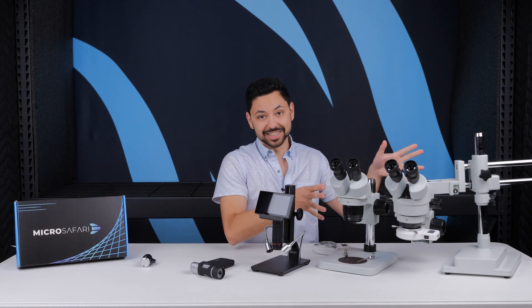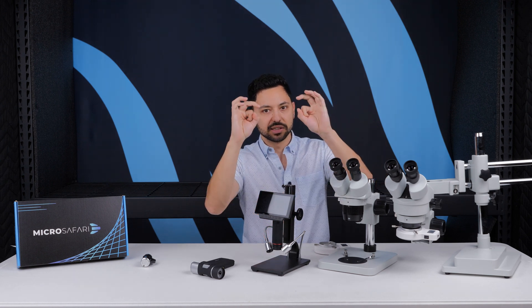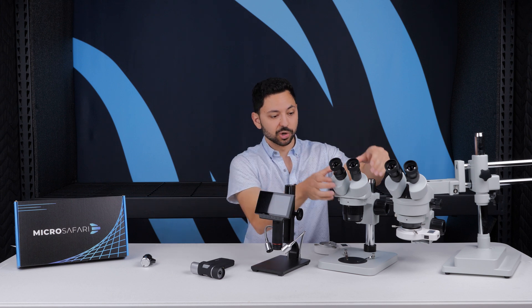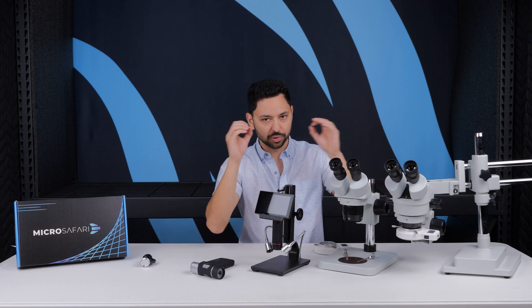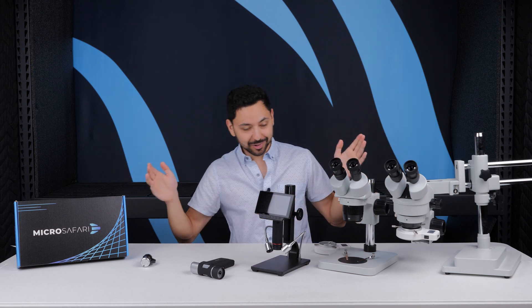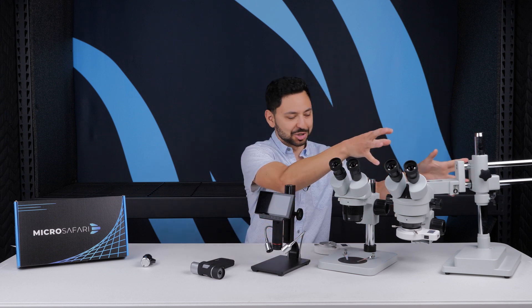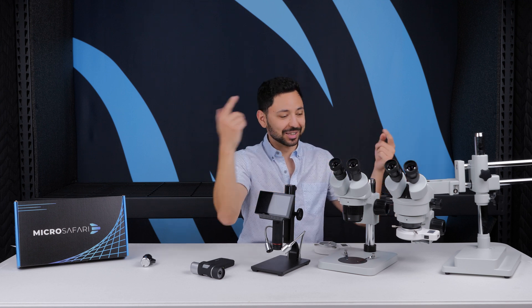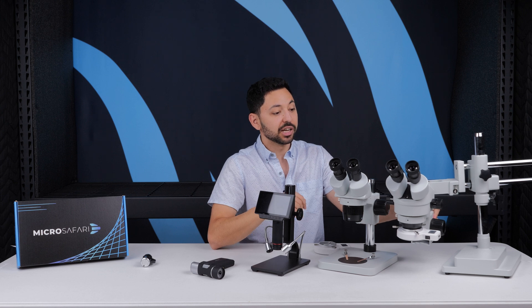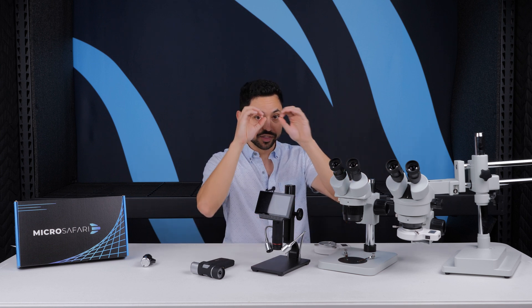Finally, we have the stereo microscopes. Kids like these a lot. I've found they don't actually struggle that much to get their eyes to the eyepieces, primarily because if you look at the eyepieces on this, the actual lens you look into is rather large—these are wide-field eyepieces, which makes it much easier to center your eyes over them. It doesn't require as much precision of the interpupillary distance. These are both reflected light microscopes, and that makes them work on a very wide range of samples and is a lot easier to set up and use. This model is going to be somewhere in the $100 to $200 range, and then this huge chunky one over here is in the $600 range. My business partner's kid loves using this thing and has actually gotten quite good at it. If you're buying this for both yourself and your kid, I highly recommend getting a stereo microscope—it is really cool to see three-dimensional objects under a microscope, which is what the binocular vision gives you.